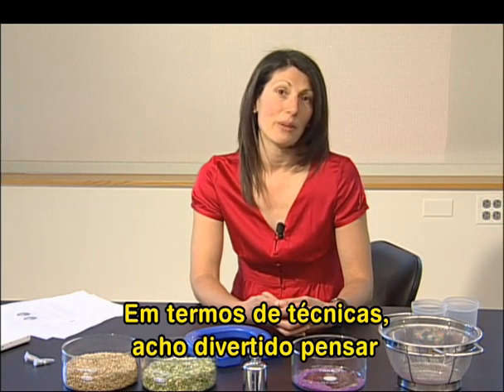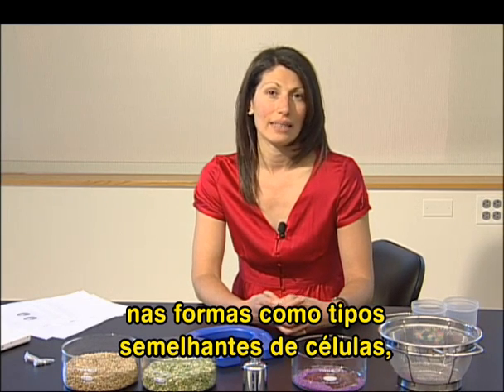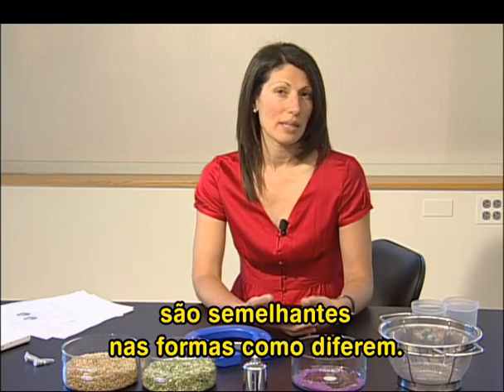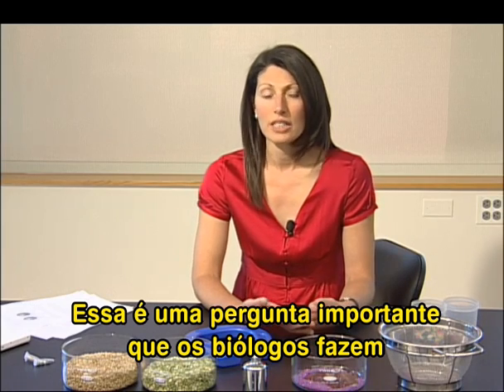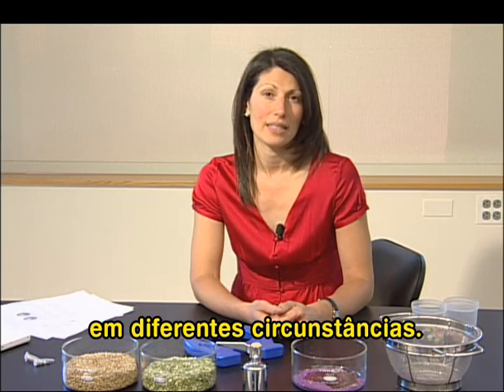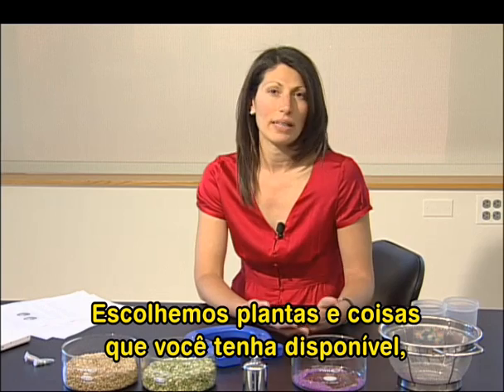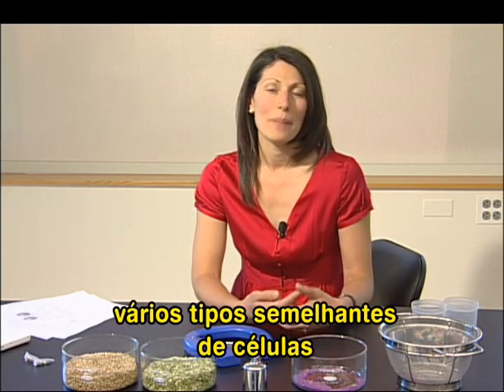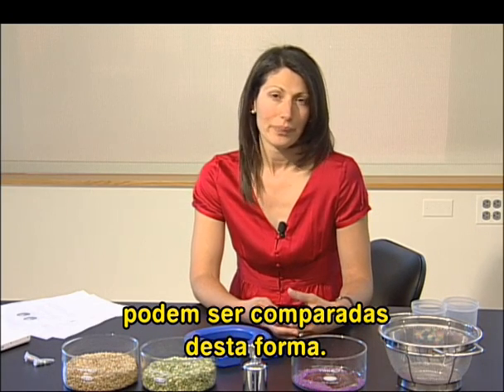In terms of the techniques that we show, I think it's very fun to think about ways that similar types of cells, like the lentils and the peas, are similar and ways that they are different. And really that's an important question that biologists ask and bioengineers can make useful in different circumstances. So we chose plants and things that you might have readily available, but if lentils and green peas aren't easily found, many similar types of cells could be compared in this sort of way.